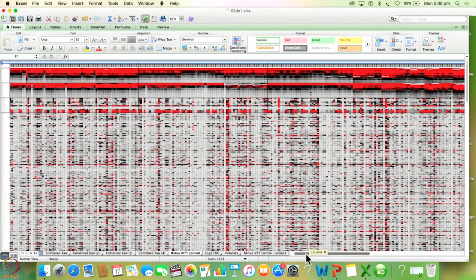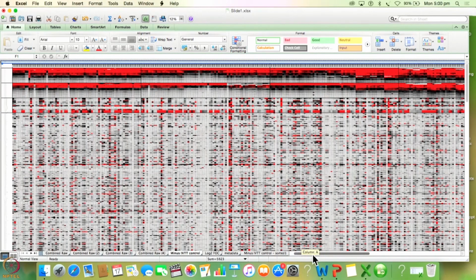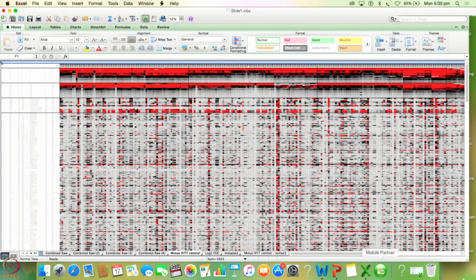Once you drag and drop, this is the kind of Excel you get. I have just minimized this, but if you apply your color gradient, this is how it looks overall. So this is what you can use now to make your heat maps, and what I have also done is sort this based on the antigens as well as the patients who were falciparum positive and Vivax positive. I have split them completely, and I have also made another Excel sheet based on age.